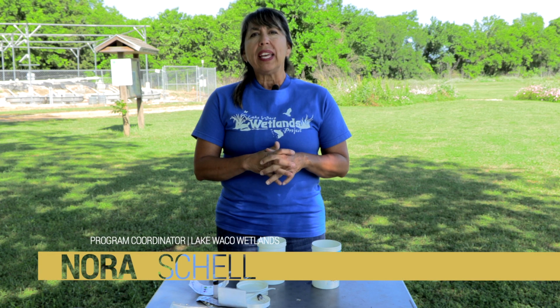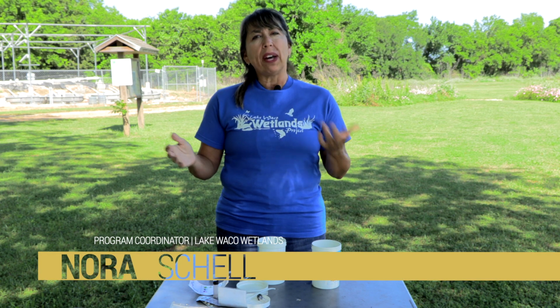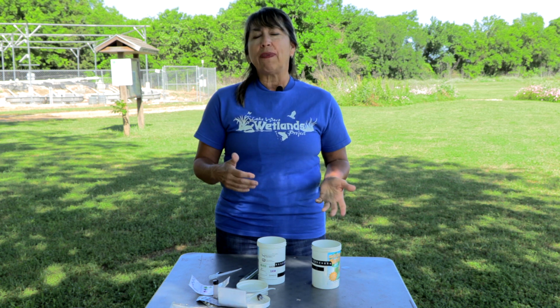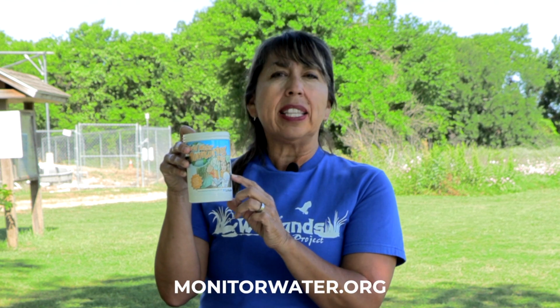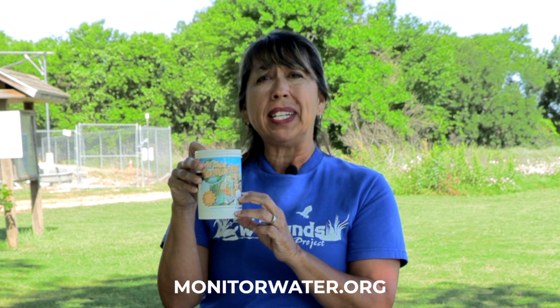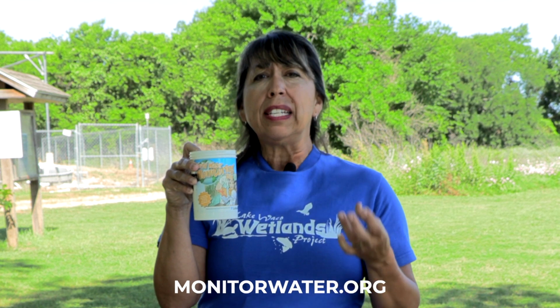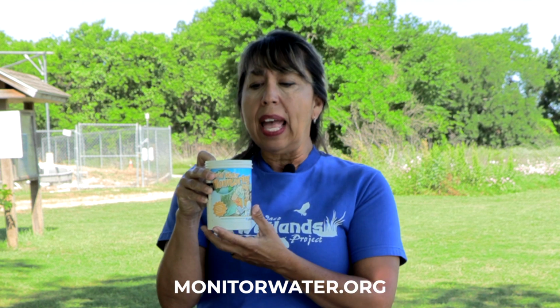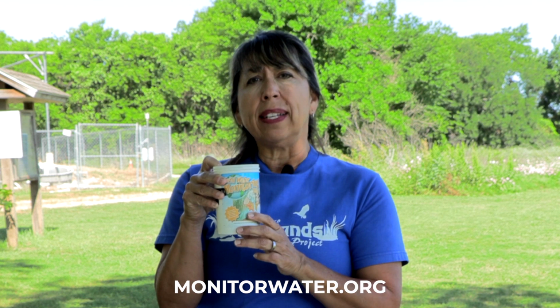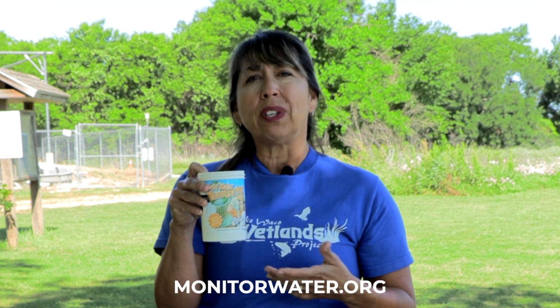Today what I'd like to do is go over some simple water test sampling with y'all and then show you what we test for out here at the Lake Waco Wetlands. Right now we're going to start on really simple water test kits from the World Water Monitoring Day, and you can look this up online and find the test kits there. They're really simple. They test for dissolved oxygen, temperature, pH, and turbidity, and these are all parameters that we test for out here at the Lake Waco Wetlands to determine how healthy our water system is.